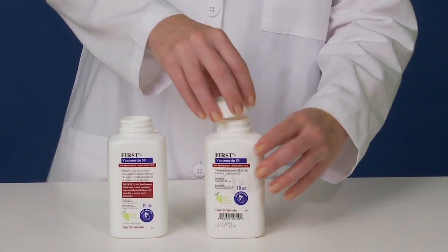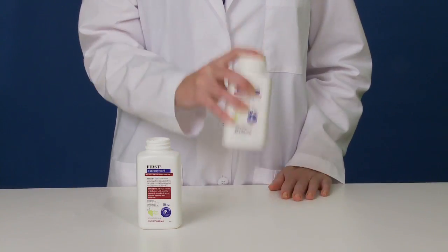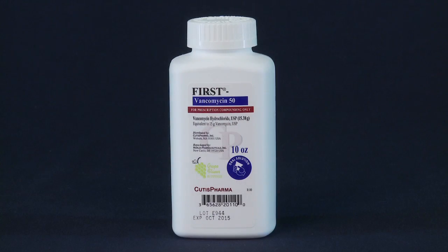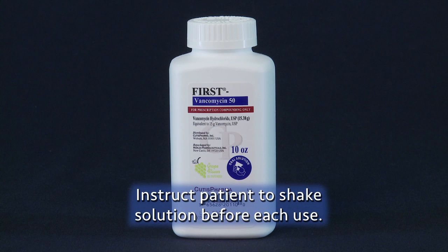Do not add the powder to the solution. Now cap the powder bottle and shake it vertically for about 30 seconds, and FIRST vancomycin oral solution is ready to dispense. Dispense the compounded vancomycin in the bar-coded powder bottle to the patient. Please instruct your patient to shake the solution before each use.